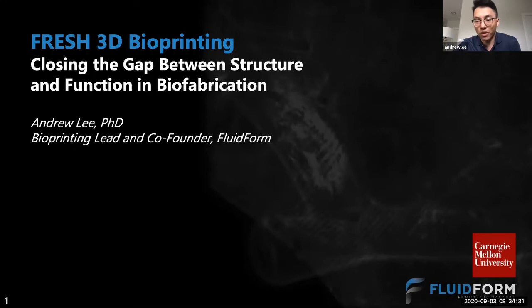So today, hopefully, I'll be able to talk to you about some of the work that was mostly done at Carnegie Mellon University, where I did my PhD, and that we've since taken out to FluidForm as a startup company to hopefully develop it further. This talk will be focused specifically on bioprinting, thinking about how we can leverage bioprinting to design tissues for structure and function.